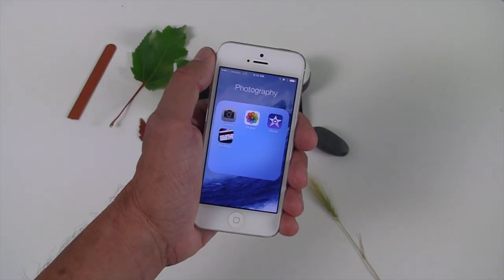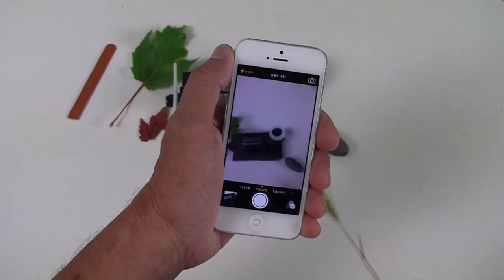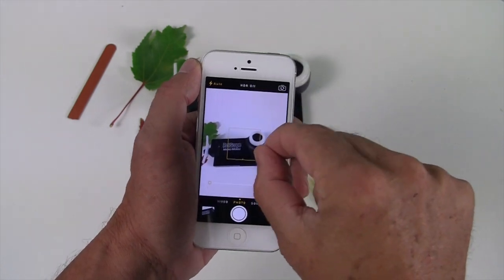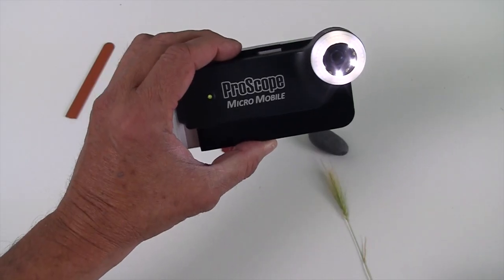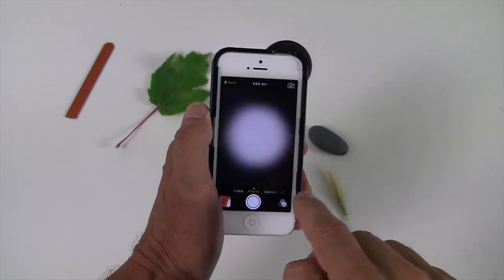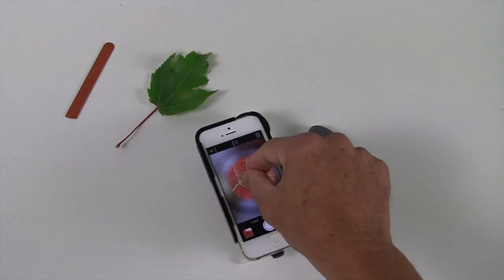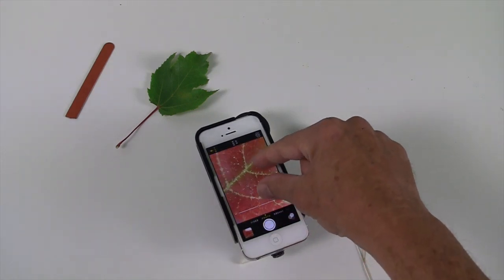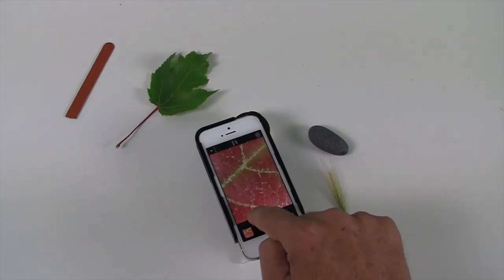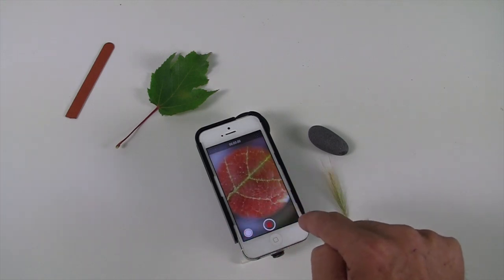You don't need to download any special app. You're just using the camera app that came with your mobile device. I'm using the pinch-unpinch to zoom. And now with my iPhone mounted in the ProScope Micromobile, I just use the camera app to view this leaf, then use the pinch-unpinch to zoom, snap still images, and shoot video.